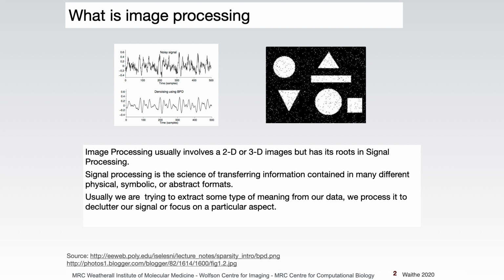Okay, so you can imagine image analysis is sort of all of the interpretation of the data. It's sort of an umbrella for everything, really, but you can think about that as sort of extracting the data from what you're doing and opening the files and all of that. But the image processing is really the processing of your signal as part of your pipeline of analysis. Okay.